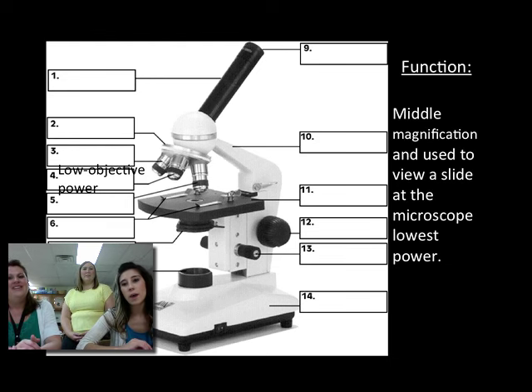This is the low objective power, and the color of the objective is yellow. It's our middle magnification, and we use it after our scanning power if we cannot see what we're trying to look for.